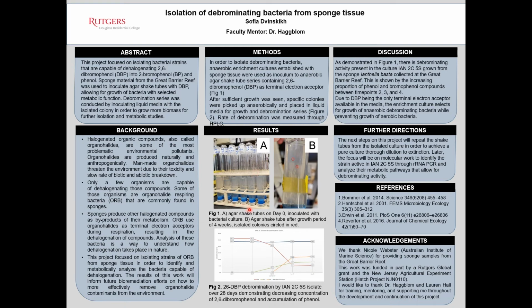After sufficient growth was seen, specific colonies were picked up anaerobically and placed in liquid media for growth and debromination series. The rate of debromination was measured through high-performance liquid chromatography.